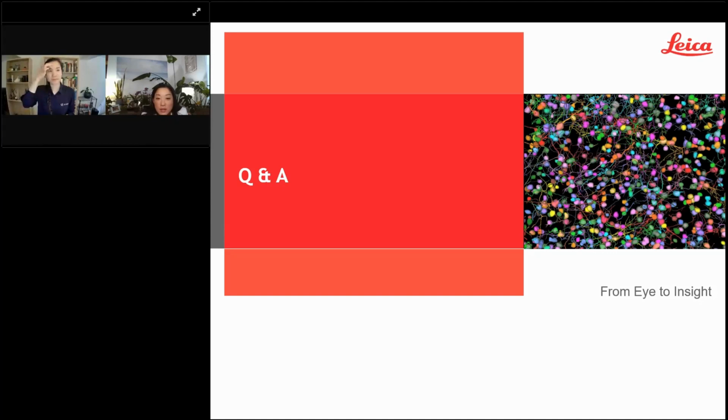Thank you. We have a related question. Can we use this software to measure velocity of 3D cells? Yep, so with the tracking, there are a number of measurements that are built in and by default calculated when you run the recipe. I believe one of them is the velocity.